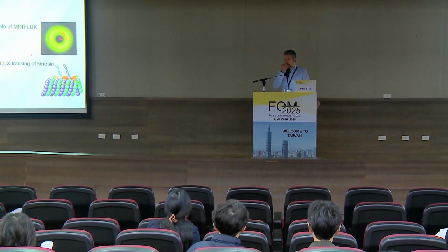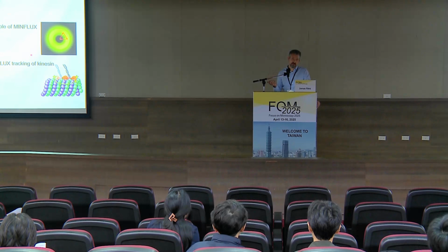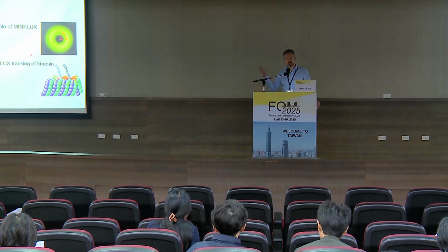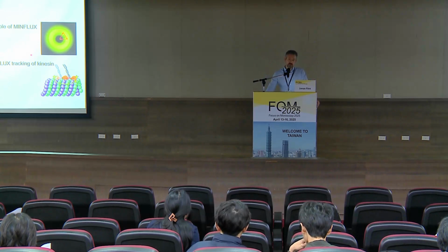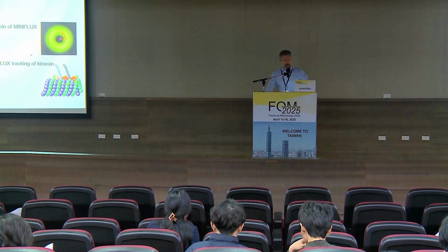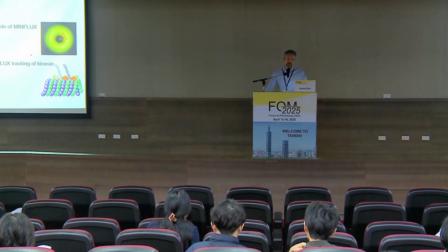Also, what we noticed is that it's very important to be super clean with the sample preparation and to really test all the reagents you use, because many reagents, fixative and so on, sometimes have a few fluorophores, which you then see, either as unspecific background or something floating around diffusely. So the negative control without any fluorophore, but with the entire sample preparation protocol the same, is the way to optimize and reduce the background of the dirt or so.